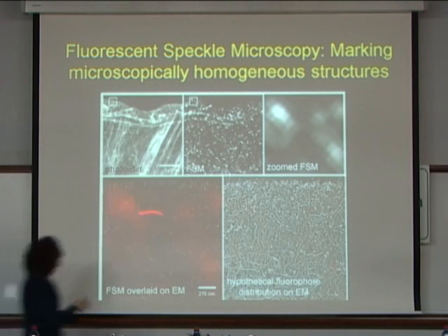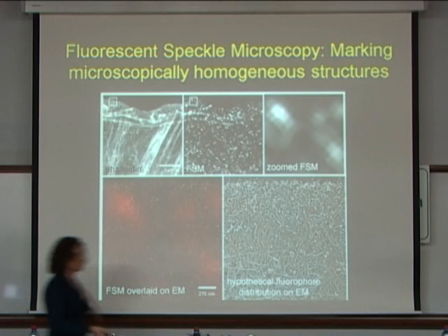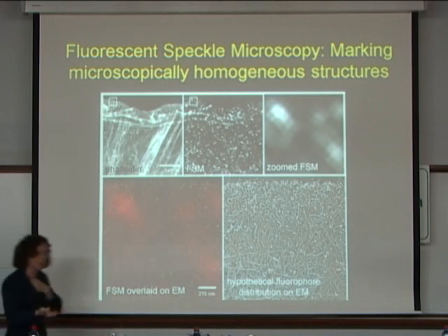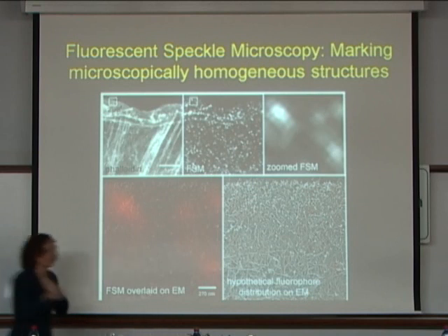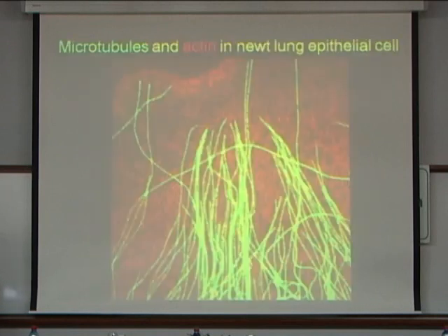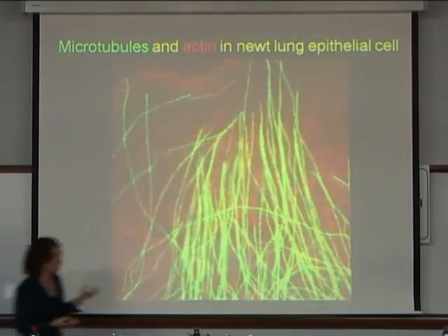So what you're seeing now, instead of the average behavior of thousands and thousands of molecules in the light microscope, is the average behavior of maybe 5 to 10 molecules. So you're getting close to the dynamics of single molecules. And this occurs at a spatial resolution of about, like I say, 1/4 of a micron. Here's a movie showing what this looks like when it's animated.